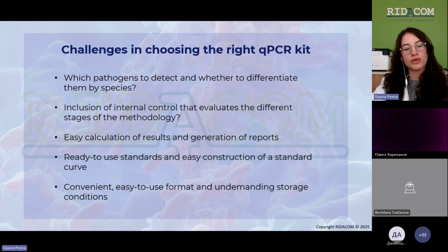And also for following ISO 12869:2019, here we have to use different standards of Legionella to create the curve through which we can calculate our results from the sample. It is specified in the ISO that we have to use at least 4 standards.